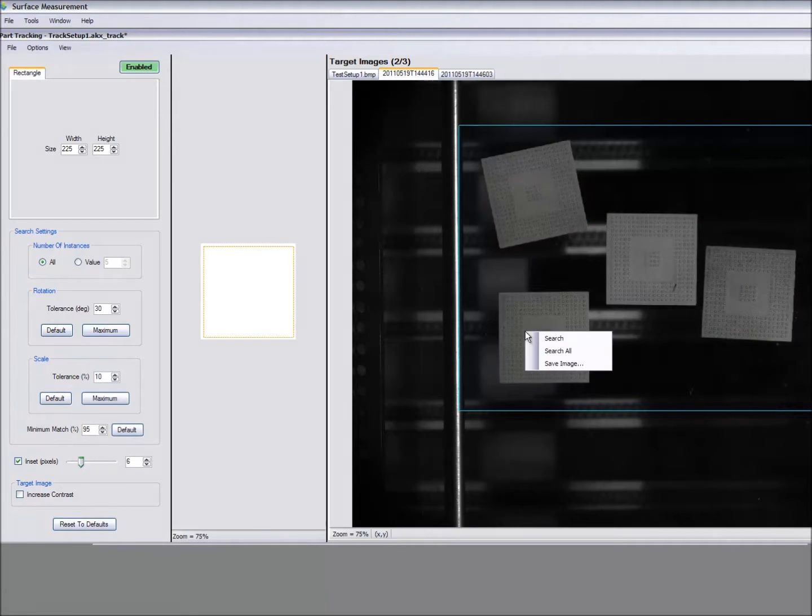With white samples and a dark background, 3 of the 4 parts are still found. In this case, found part number 1 is the sample we just looked at in the previous example. When we increase the minimum match to 98%, the previously found sample 1 is removed from the found parts. Even though 2 samples are still found, this minimum match value is way too high for practical use. Generally, around the 65% range is a good choice for minimum match.